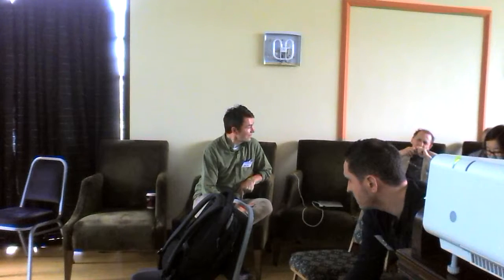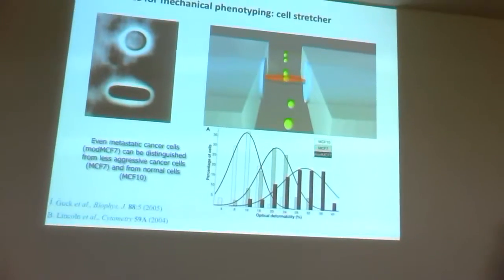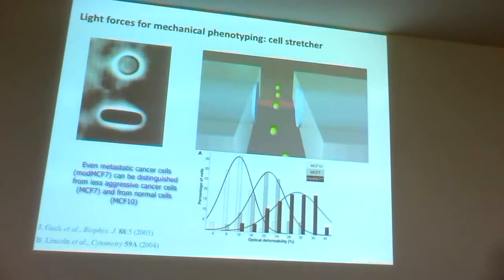But what you have to do in the microfluidics is turn the acoustics way down, because we'll blow the things up. But anyway, I think there's potential for doing that, and integrating all this magnetic, acoustic. But the optical, you know, the forces are just so much smaller. But your wavelengths are great, so it's a question of what regime is going to work. Yeah, sure. Acoustic traps have a lot of potential.